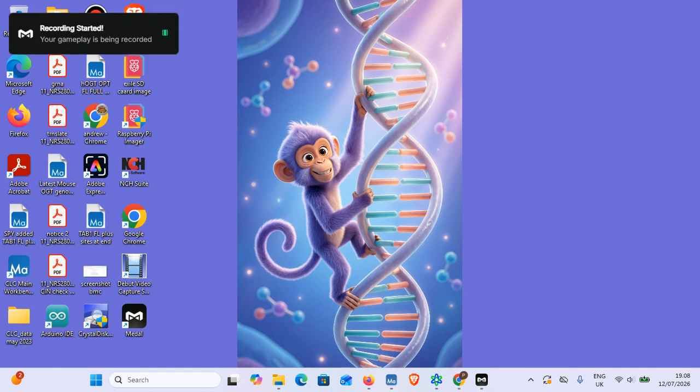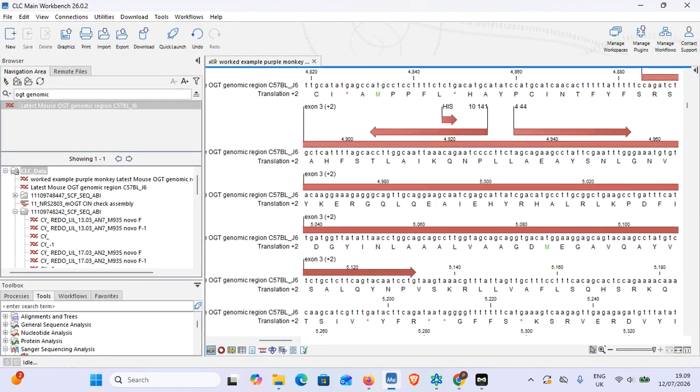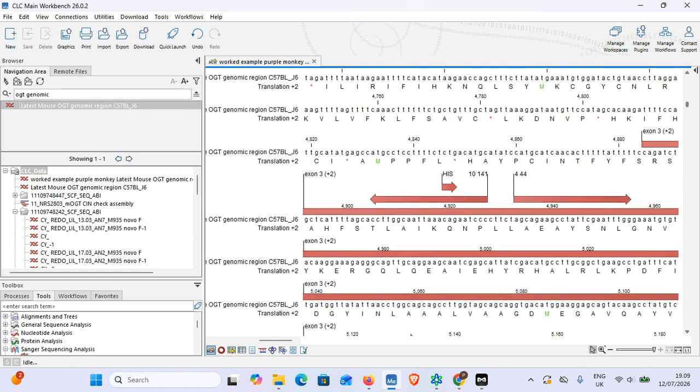Okay, welcome to my fourth video, following hot on the heels of the previous video where we left off at Exon 3 of mouse OGT and we were having designs, pun entirely intended, on CRISPR. So what we're going to do will require us accessing a few more websites, because it's one thing to have the sequence laid out in front of us. We now are going to have to literally ring in the changes, but we don't want to muck things up.